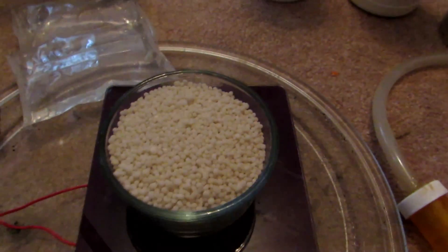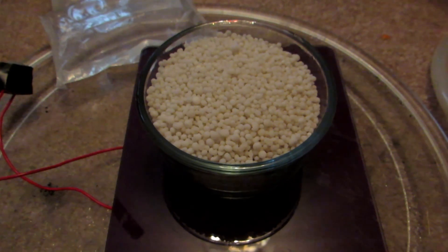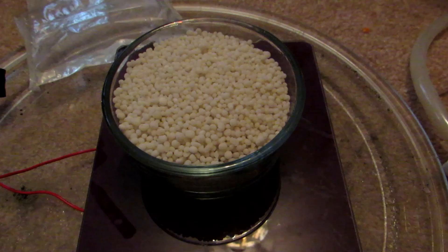I have it weighed out — 160 grams exactly, which is perfect, because we can do four batches with this all through the same solution of hydrogen peroxide to get a fairly good concentration of nitric acid.